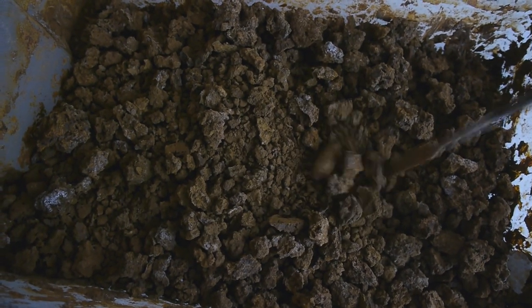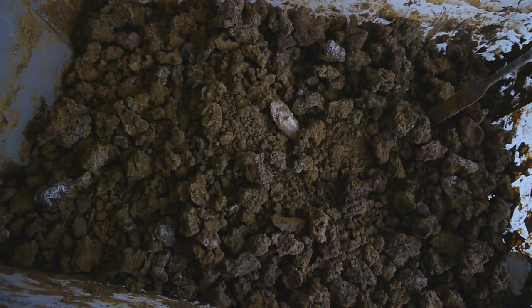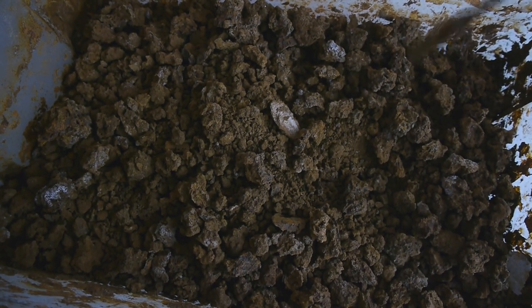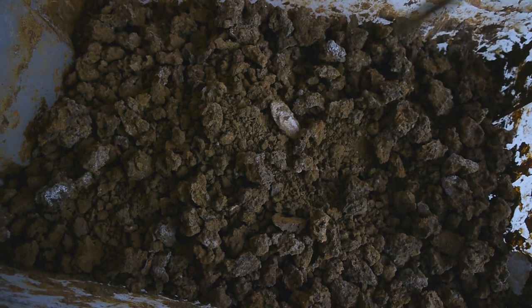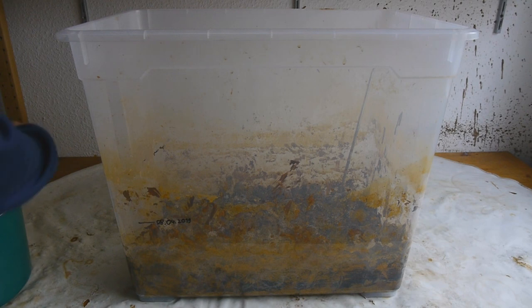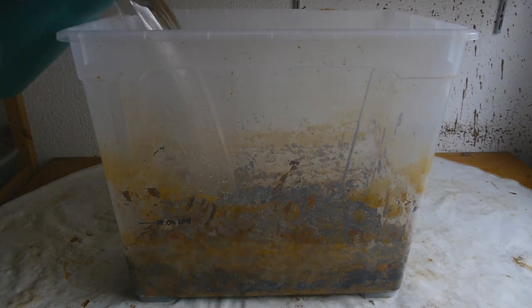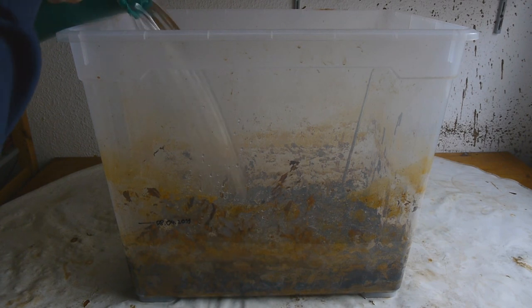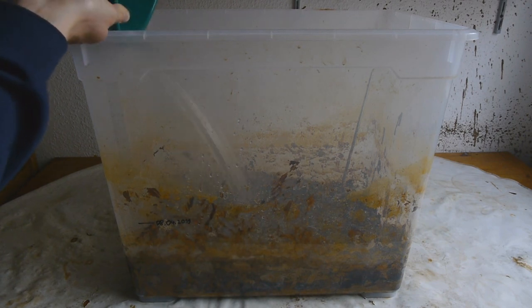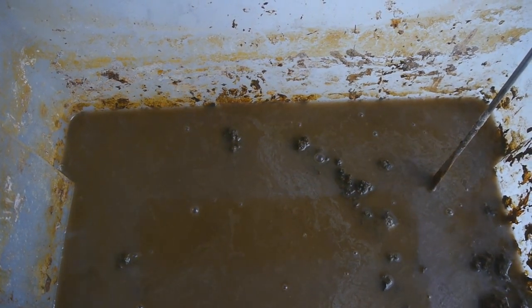Nice and dusty now, but this still contains a ton of sodium sulfate that we now need to wash out, but washing it out should be a lot easier now that everything is dried up. So we'll just add a lot of warm tap water. It's bubbling nicely because of all the air in between, obviously.